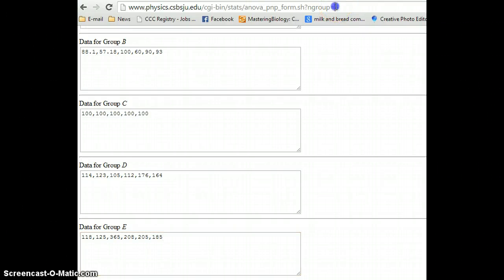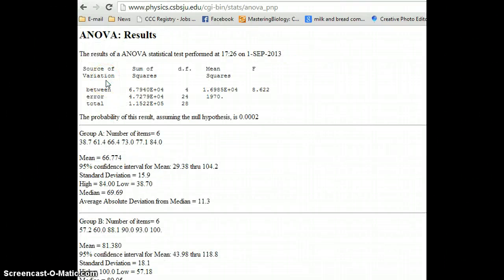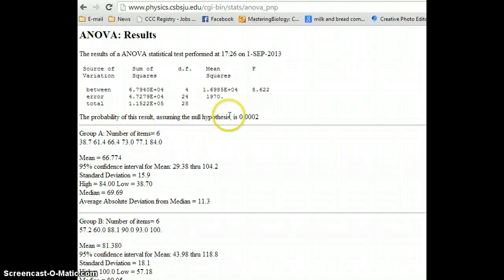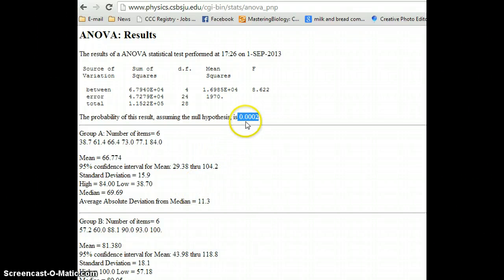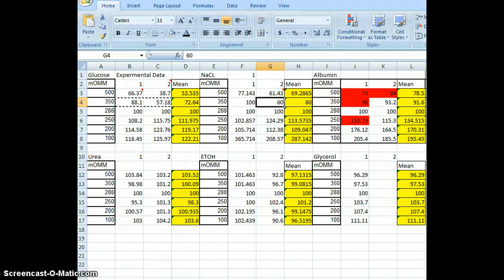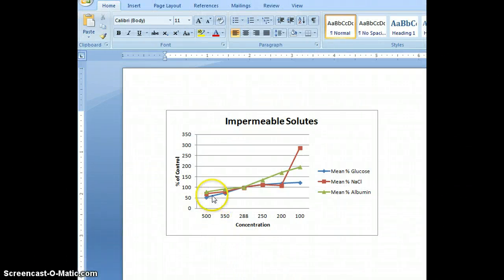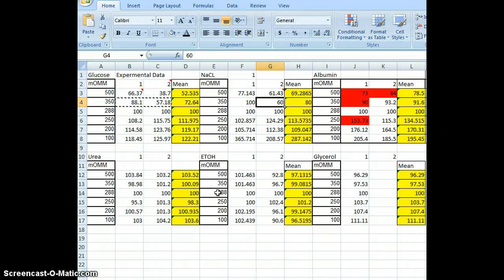I scroll up and click Calculate Now. It shoots out a p-value along with a lot of other values — sums of squares, sums of means. It's actually a nice website. It says the probability assuming the null hypothesis is 0.0002 — so that's your p-value. That is certainly less than 0.05, which means we had a significant difference between all of our concentration groups. From one set of points to the next, it was a significant change. When you do the permeable solutes, hopefully that p-value is closer to 0.50 or so.